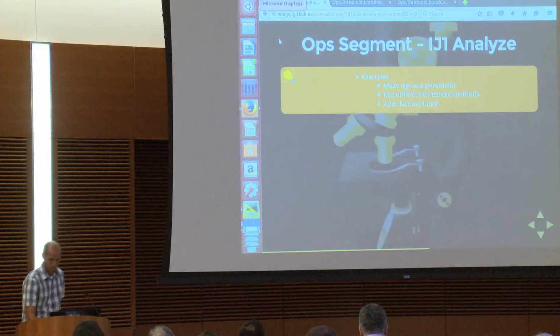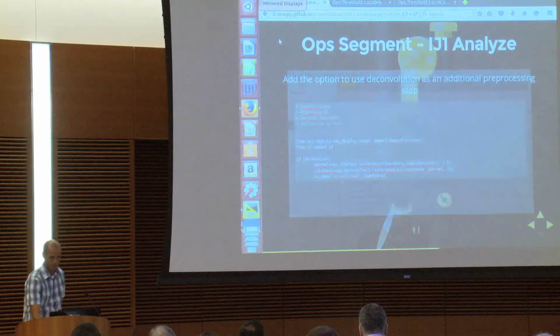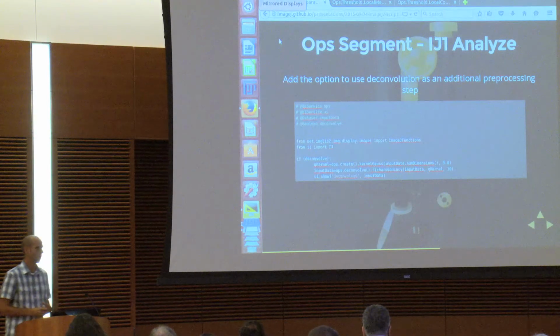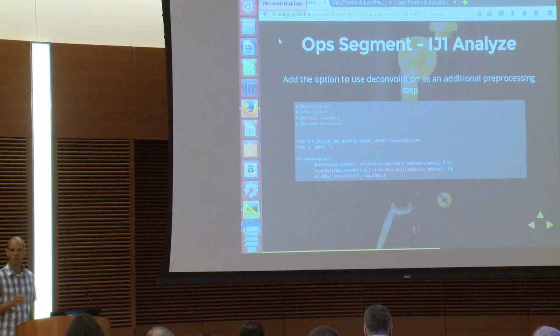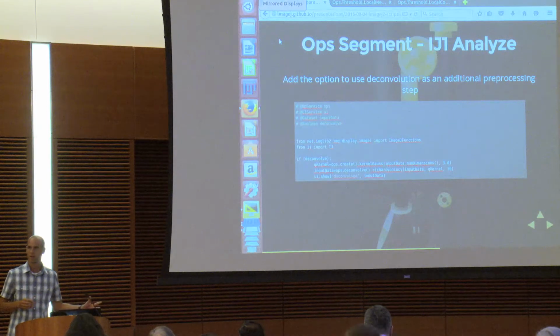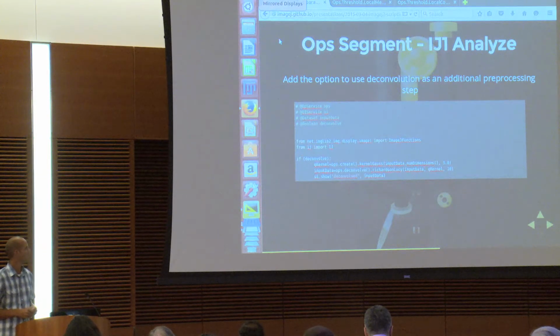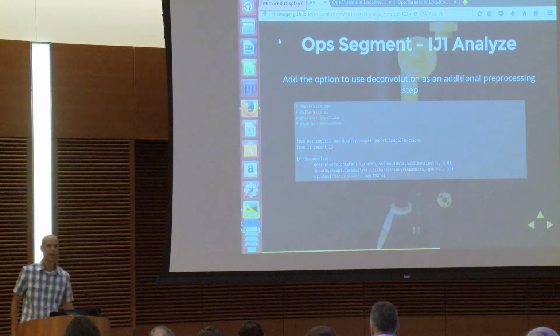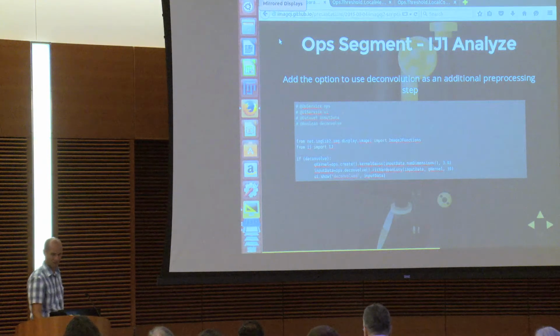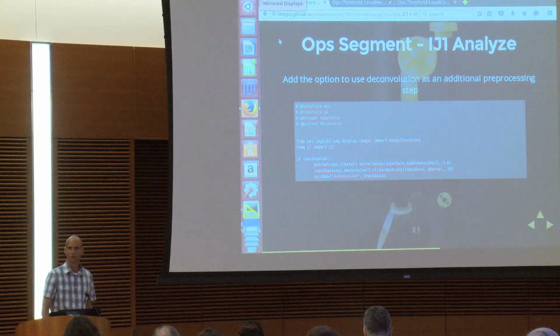So the code I just used is embedded in the presentation. So later on, if you want to, you can go back to this presentation, just cut out this code and embed it into the original script, and it should run. And if there's any problems with that, just ask a question on the listserv or Gitter. Are there any questions about that workflow?